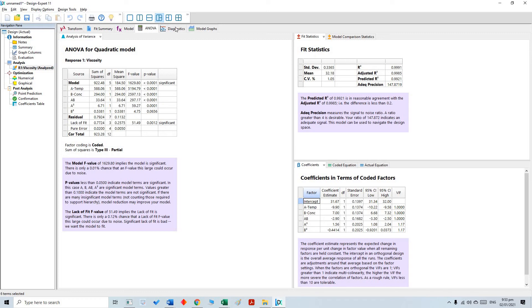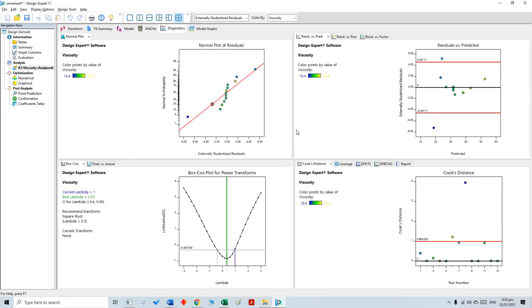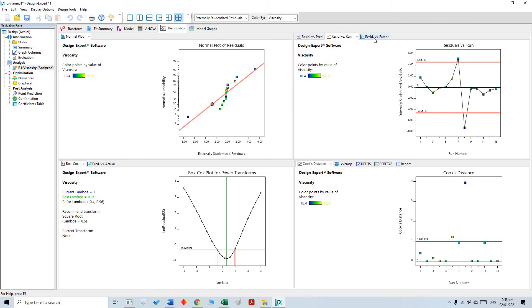The next thing is diagnostics. There are a couple of tests available to check whether this model is significant and whether it is accurate. Details about these tests can be found in the literature.